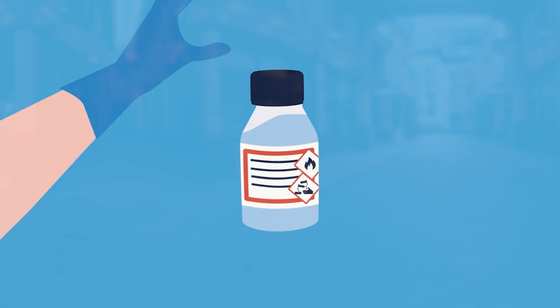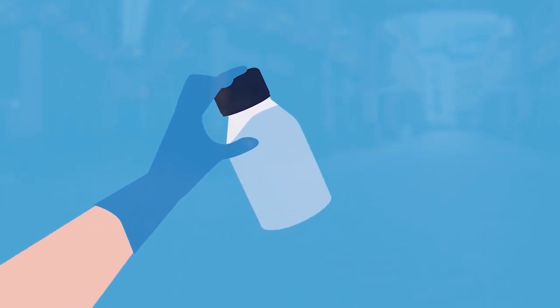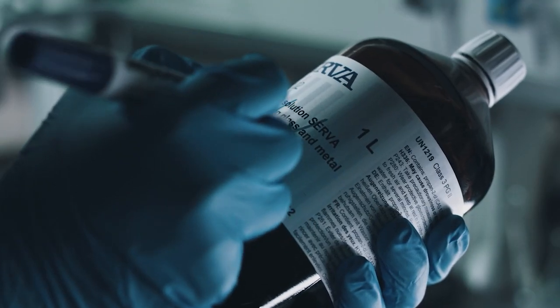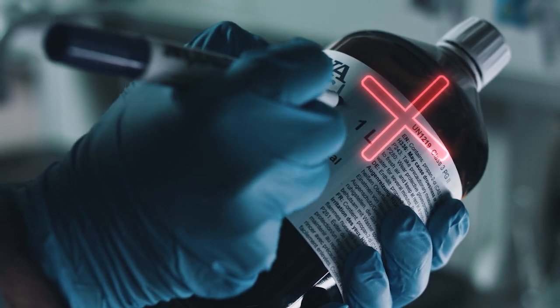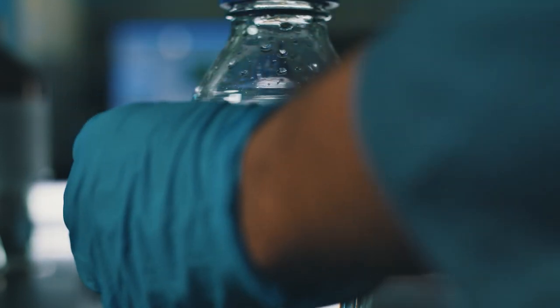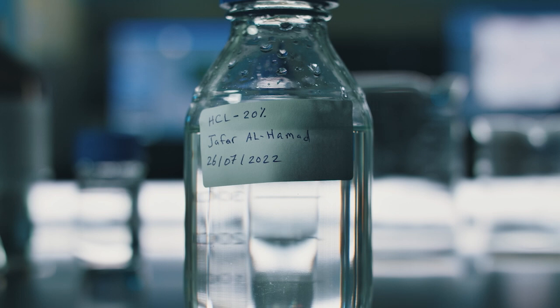Before a container is reused for another chemical, the obsolete label should be removed completely and the container must be thoroughly washed and allowed to dry. It is unacceptable to use a marker to write over an existing manufacturer label. A secondary label for temporary use must have the name of the chemical, the name of the person who filled the container, the date it was filled, and the hazards.